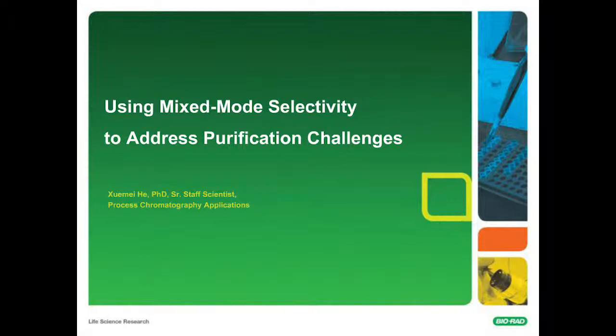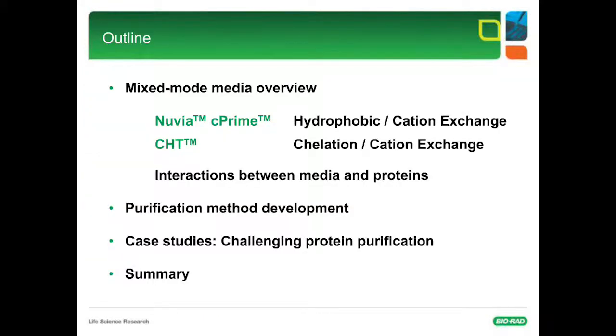So hello everyone, and today in my talk I will focus on two mixed mode chromatography media. You see on the next slide. The first one is Nuvia C Prime, and the second one is ceramic hydroxyapatite, also known as CHT. I will show you the structures of the chromatography resins and the possible interactions between the media and the biomolecules.